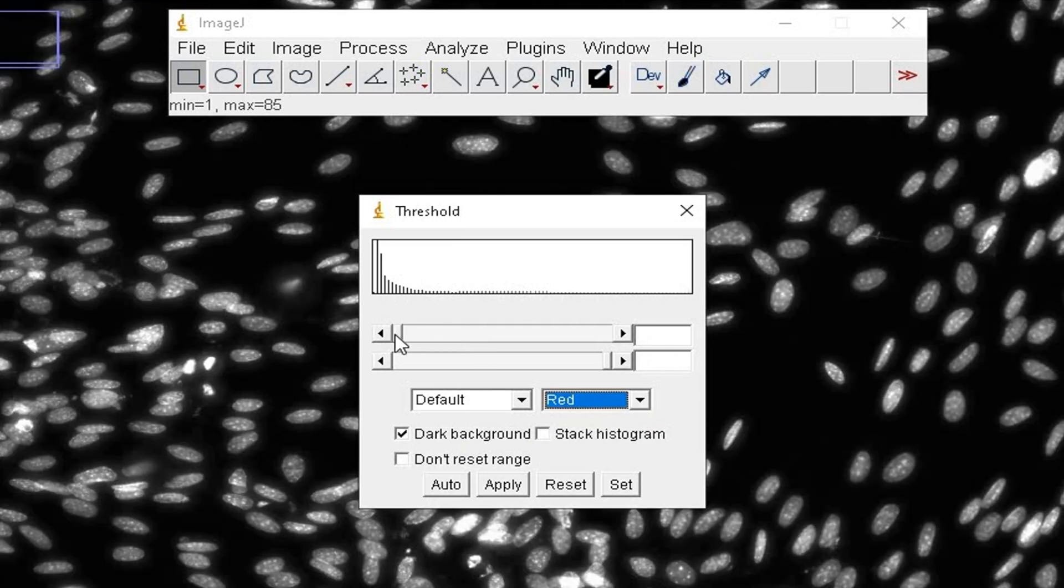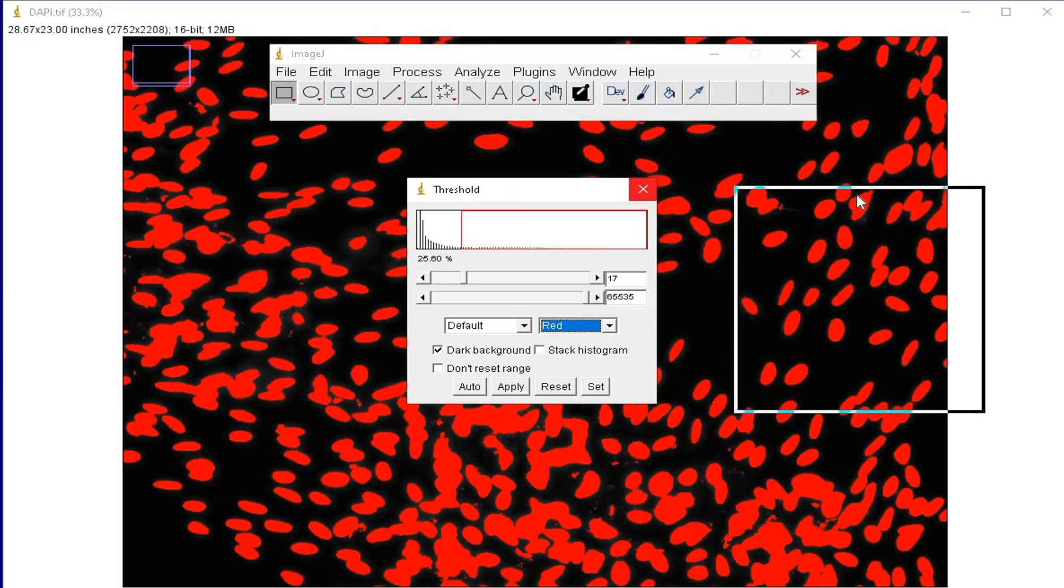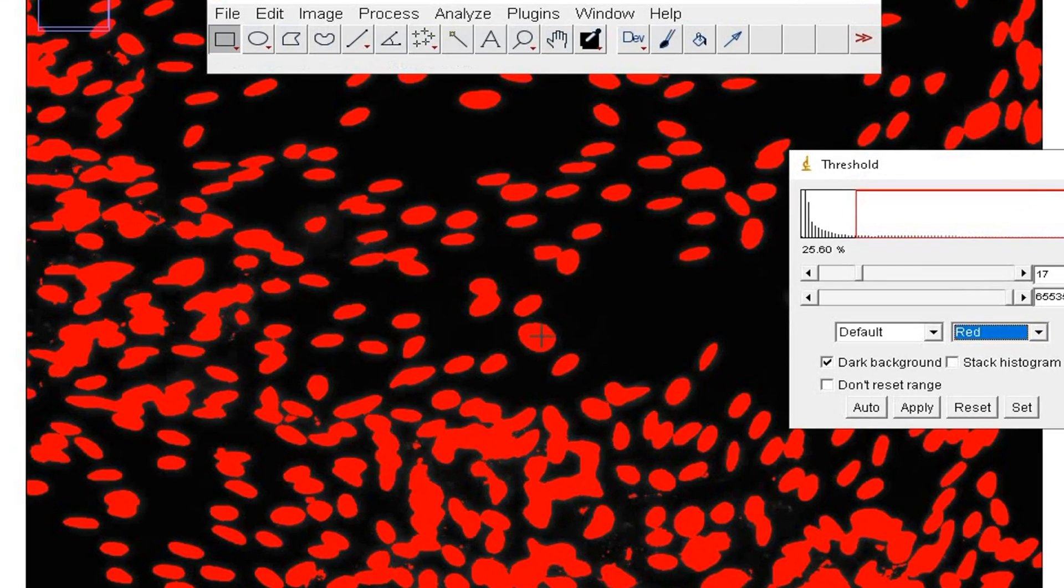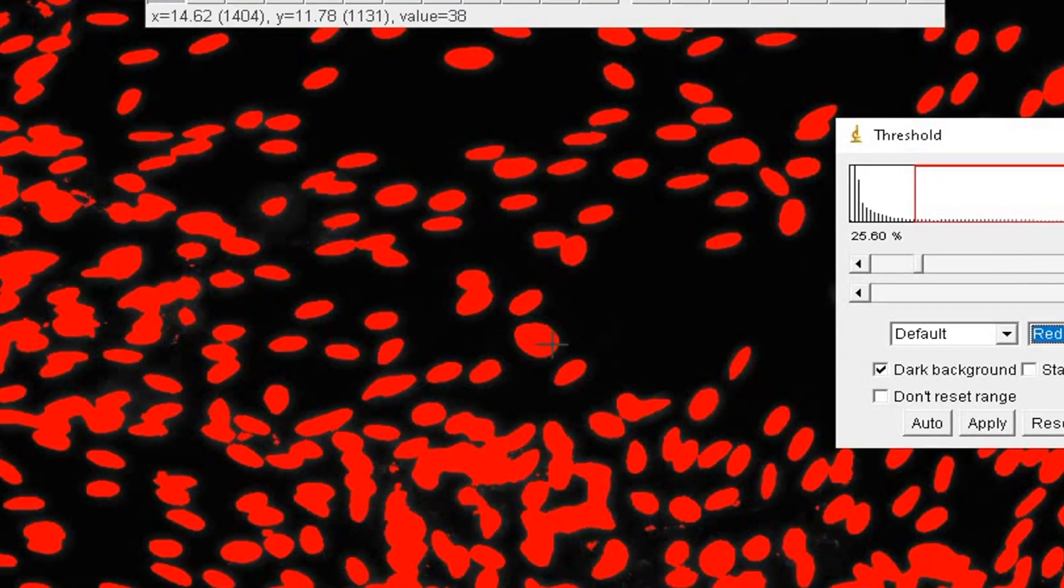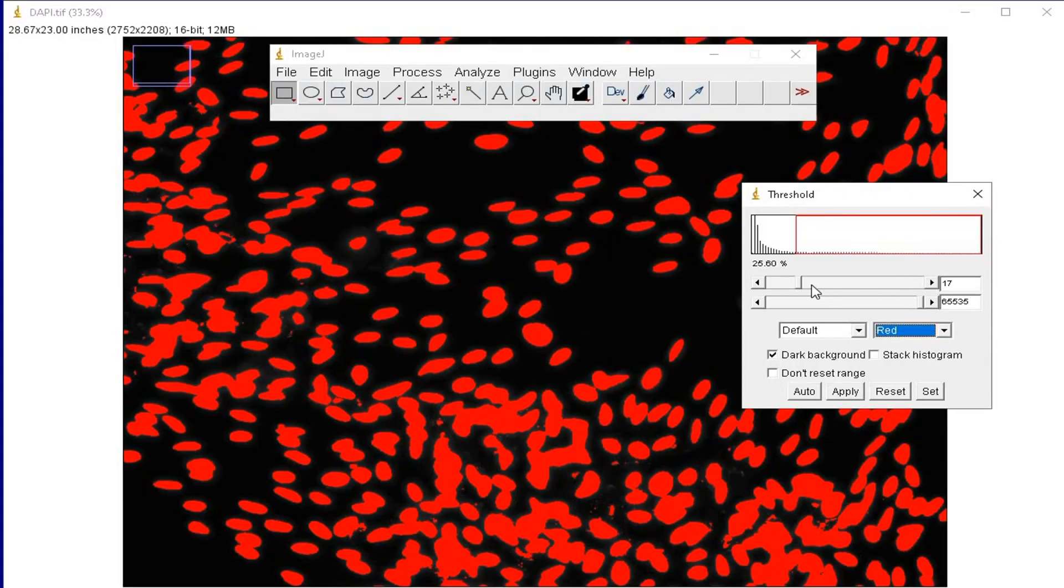Use the slider above to change the DAPI staining to red. For example, now this cell here is red in color.